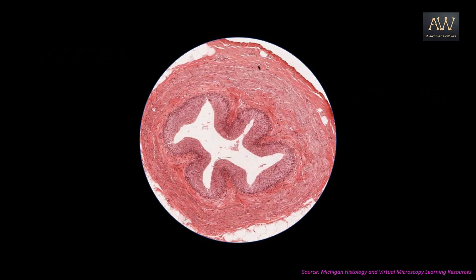While we can again see a little bit of free space here, the actual free space to look out for in this slide is the central lumen which is surrounded by the epithelial tissue. However, the layer on the exterior edge of the tissue is also a special type of epithelial tissue known as the mesothelium.